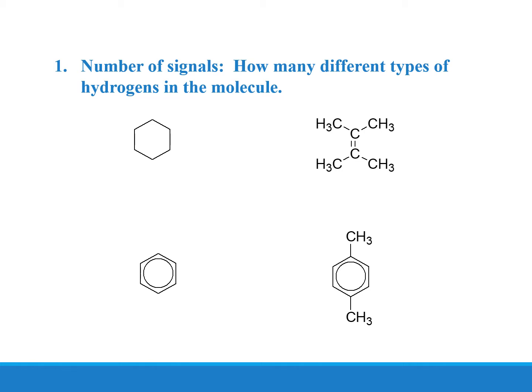The middle carbon atoms that have the double bond have no reading; they will have no signal because they do not have protons, whereas all the methyls are equidistant to the double bond and they will have the same reading, so for this structure you will expect only a single peak.